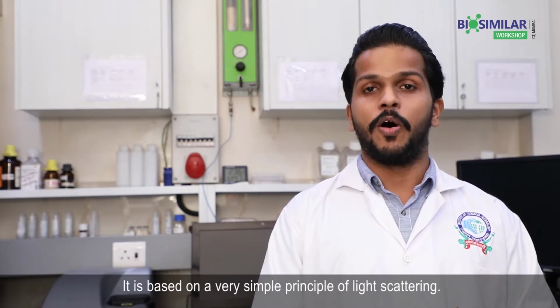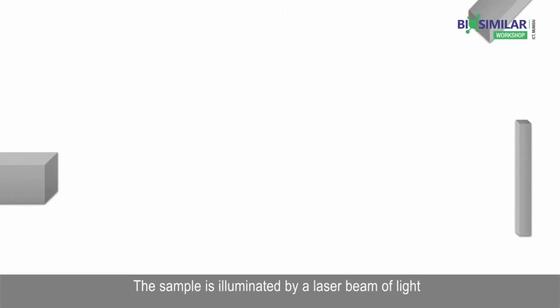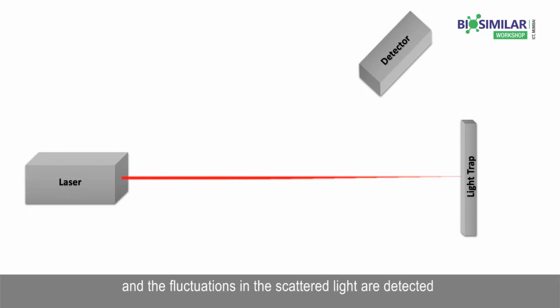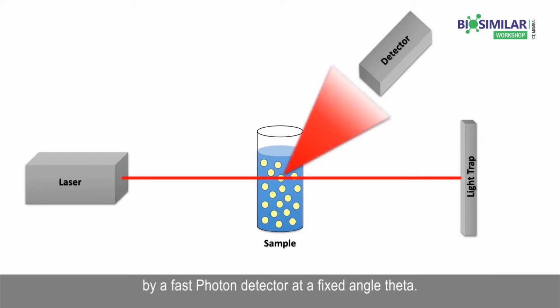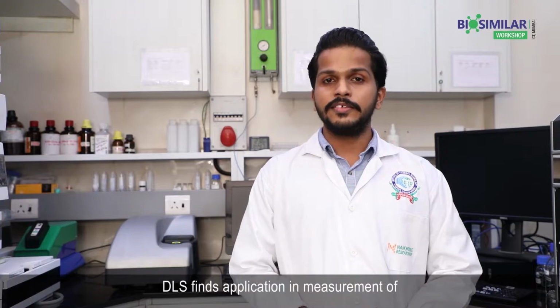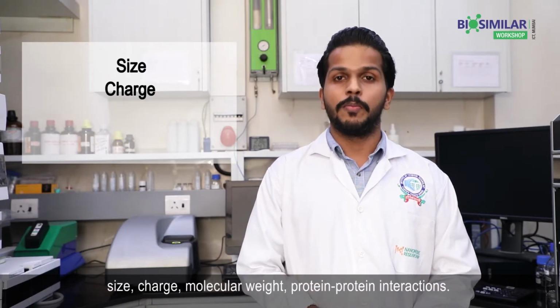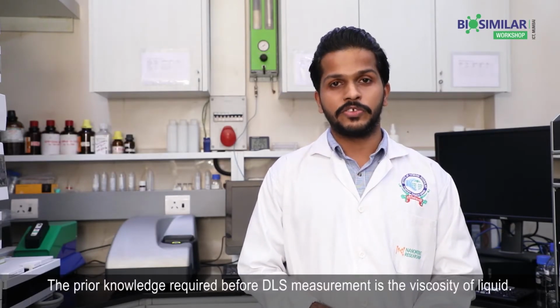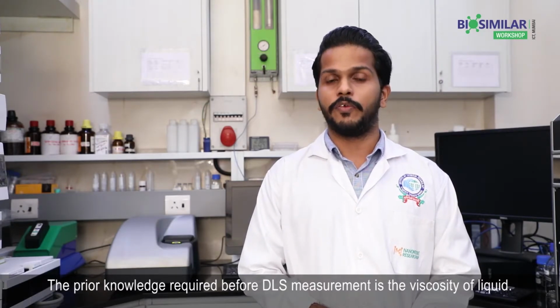It is based on a very simple principle of light scattering. The sample is illuminated by a laser beam of light, and the fluctuations in the scattered light are detected by a fast photon detector at a fixed angle theta. DLS finds application in measurement of size, charge, molecular weight, protein-protein interactions. The prior knowledge required before DLS measurement is the viscosity of the liquid.